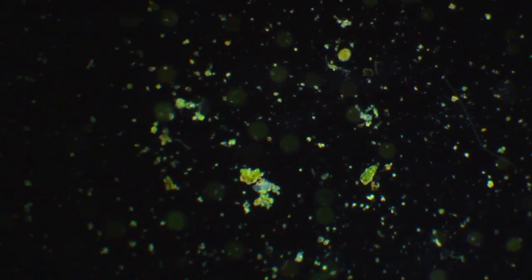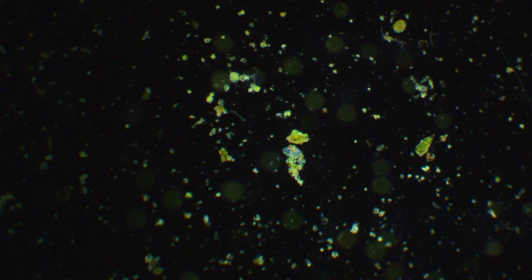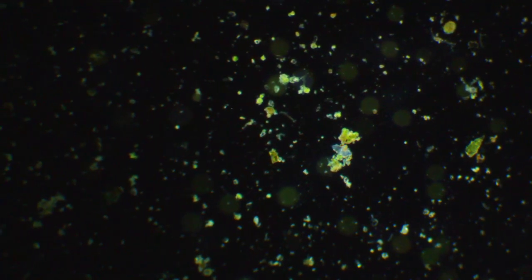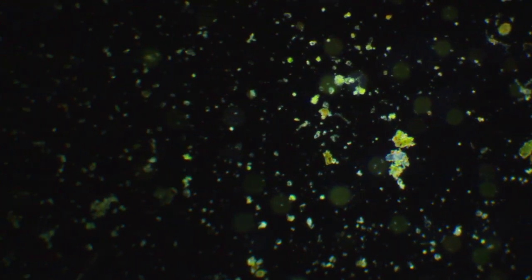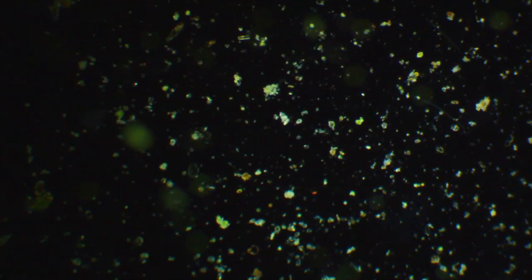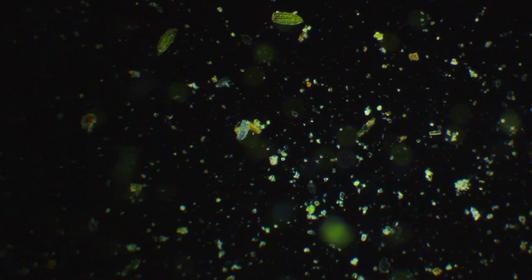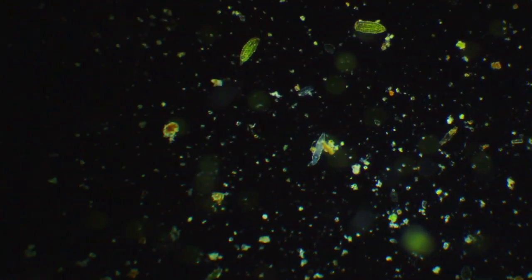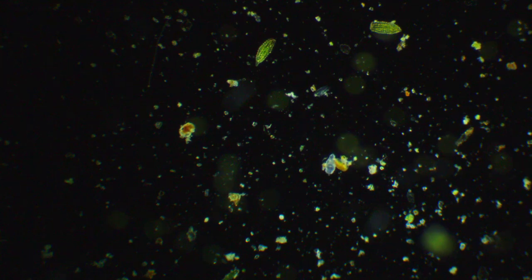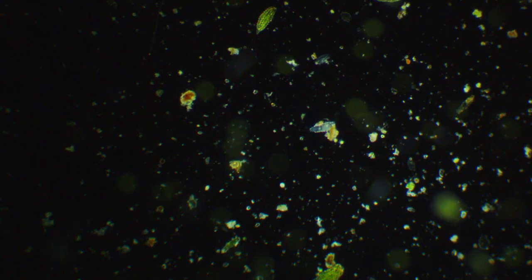Do rotifers get pregnant? It's a good question. Why, do you think this one's pregnant? Does it look pregnant? I don't know. That's a good question. I know that tardigrades do. They carry eggs around. Oh, here's another rotifer. It seems that every time I try to get some moss off of something, I find these little guys.